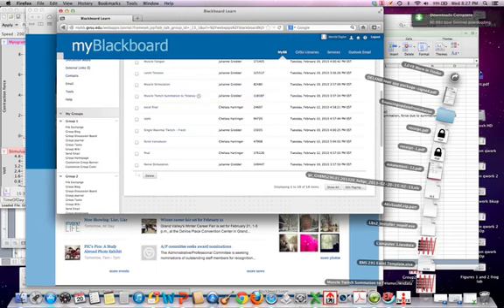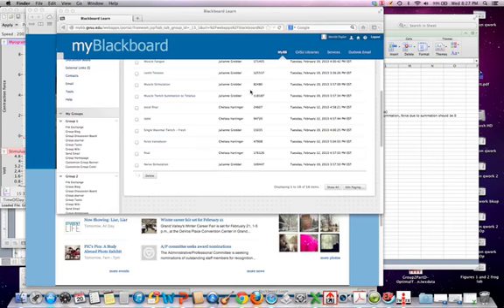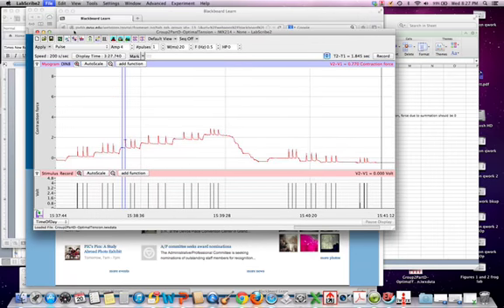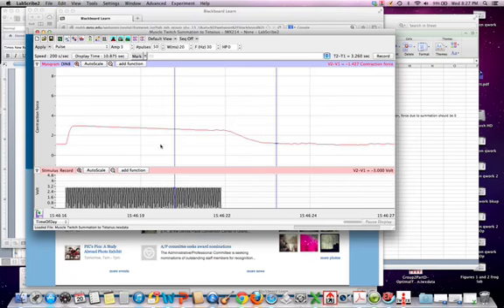Okay, now I go here. That should be okay, fine. Now we go back to, let's open this up. And there we go, so it's there all the time. Great. All right, so now I've downloaded this file.